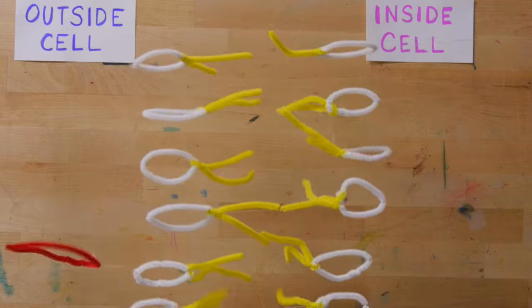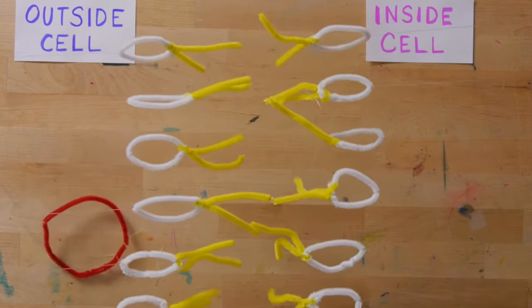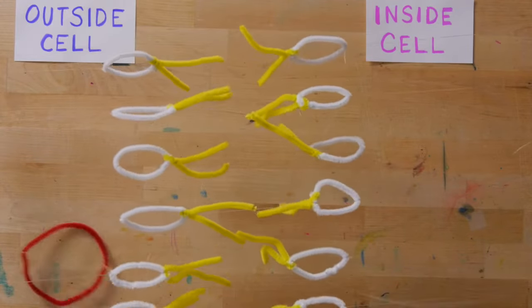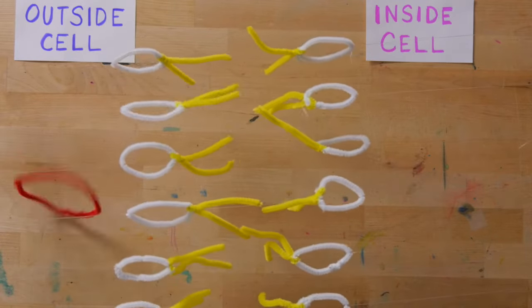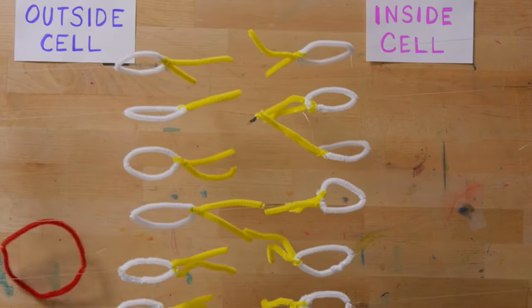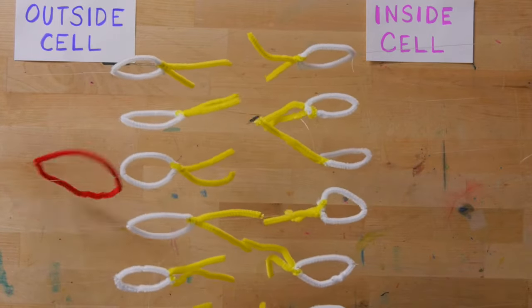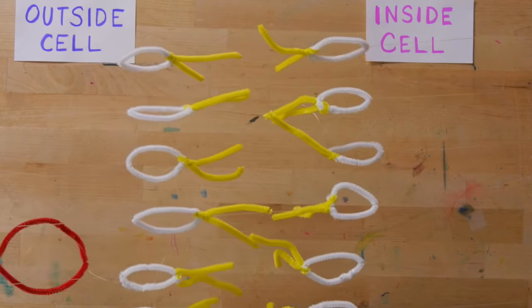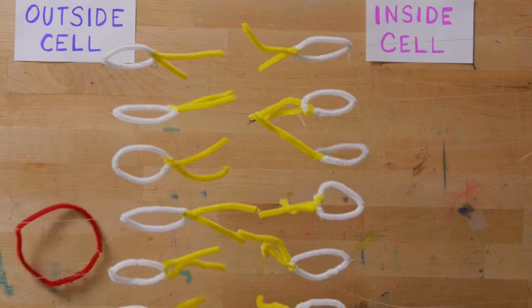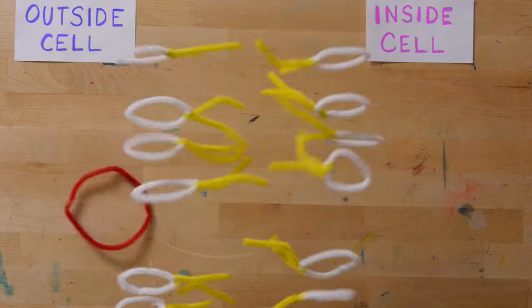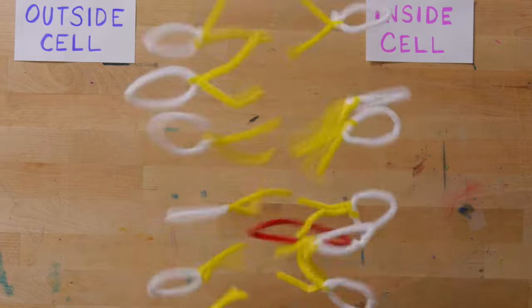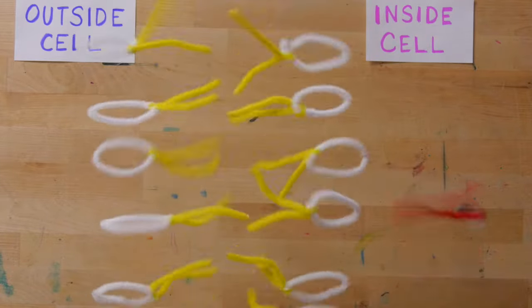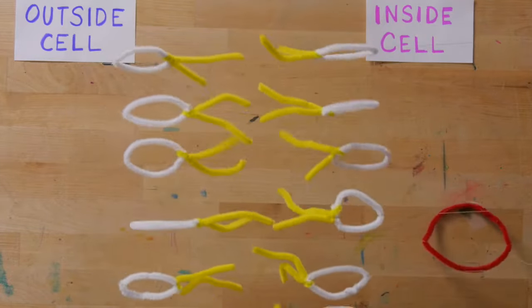When there's a cold temperature, that means there's not a lot of energy. So these phospholipids tend to be very firm, and we see that the plasmid will not actually be able to pass through. It kind of bounces off the phospholipids and stays out. But what we're going to do is called a heat shock, where we're going to add energy by heating up the cells. When we do this, that causes these phospholipids to bounce, and the more they bounce, the bigger the holes get. And these plasmids can sneak on through into the inside of the cell.